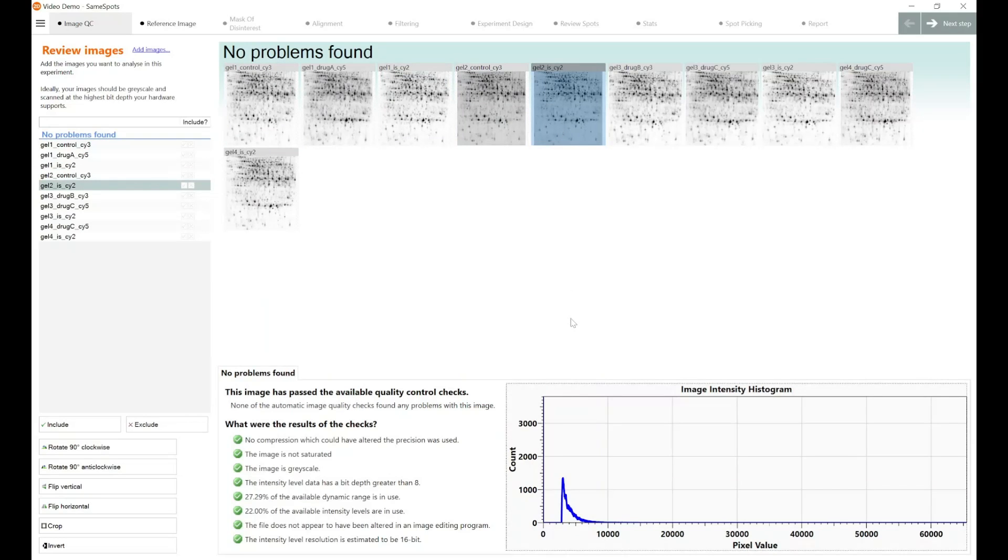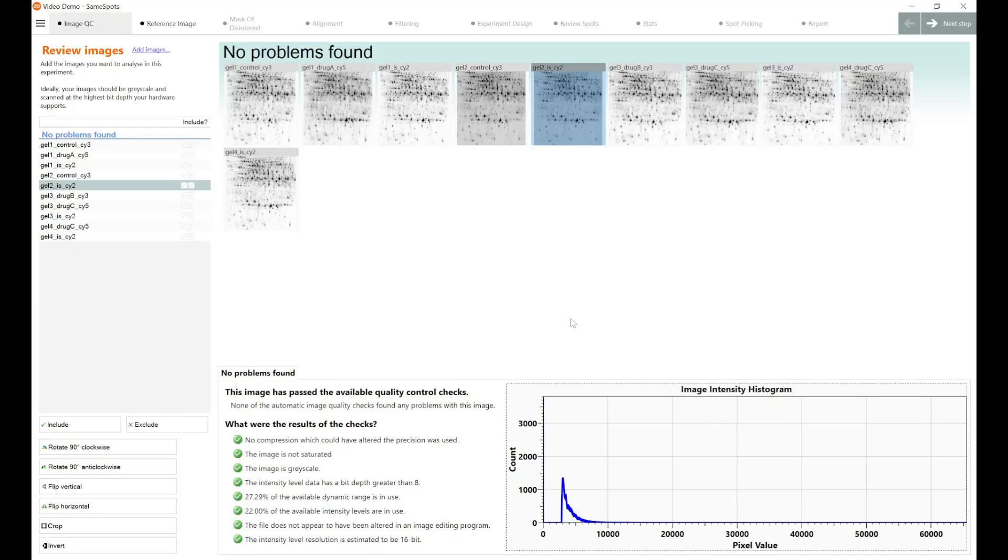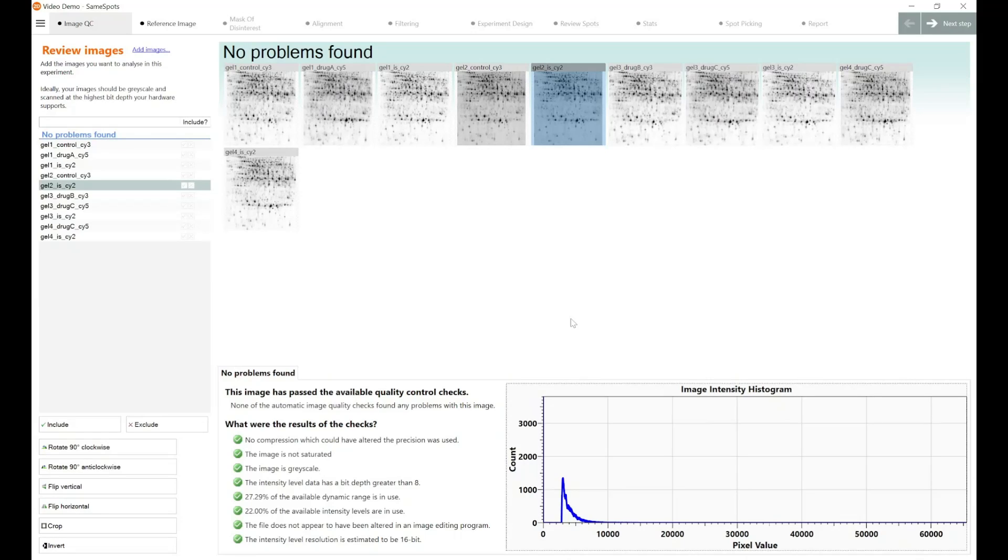The histogram at the bottom just shows you how many pixels you have on the left-hand axis, and the range of pixel values on the bottom axis. So those are the number of pixels on the left, and then the intensity of the pixels on the bottom axis. This is how SameSpots can allow your operators, your lab, to maintain a high level of quality control for the images that are going to be analyzed, and the assumptions and the experimental hypotheses that are going to be proved as a result of your analysis.